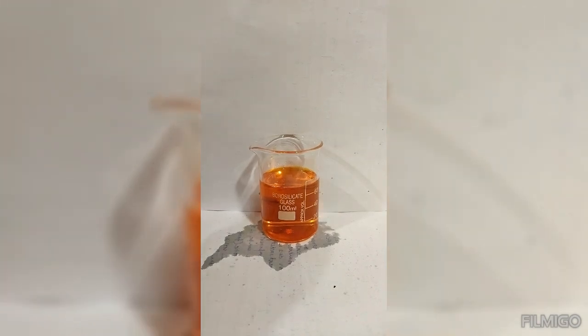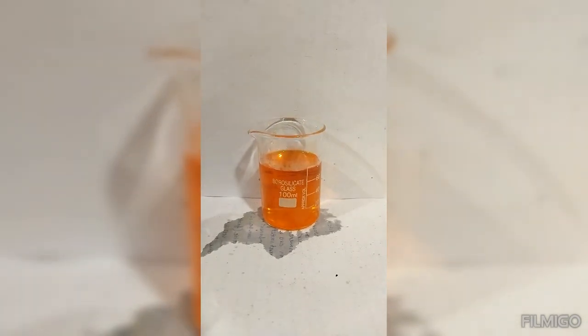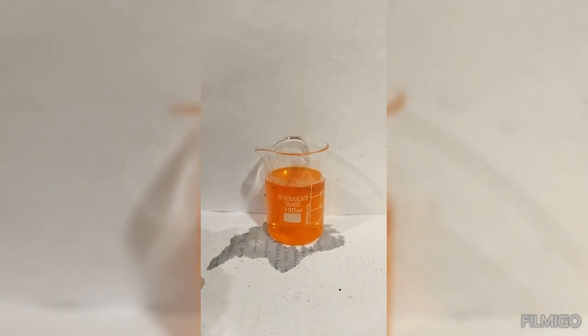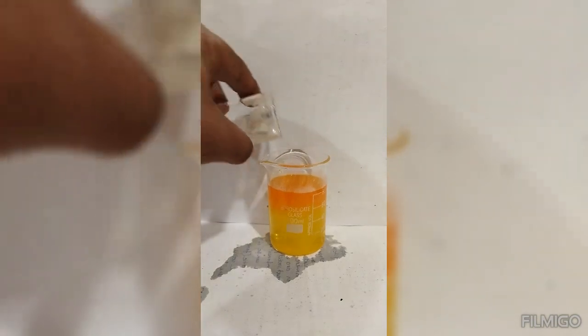Then, we add sodium hydroxide solution. Here, we see that the color starts to change from orange to yellow. Now, we add excess sodium hydroxide solution, and we see that the orange color is converted to a light yellow color.